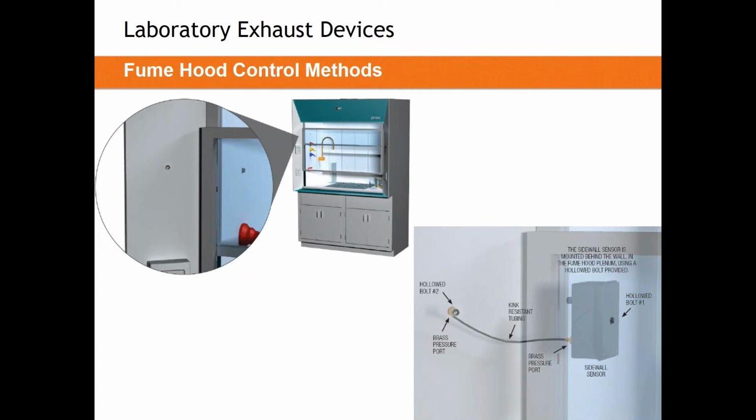You can also get a little bit more creative even, and you can actually combine these two strategies into a very effective two-stage control system. So what I'm getting at is if you have a combination sash, combining these two styles of control into a hybrid style is extremely effective. A combination sash may still be operated as a vertical sash. That might be moved up and down vertically. In that case, you do want that quick speed of response from a sash position sensor. However, if that sash is closed and the horizontal panes of glass are moved and opened and closed, that sash sensor won't be very effective. Actually, it won't be effective at all.